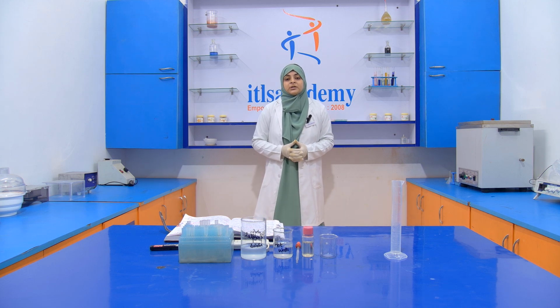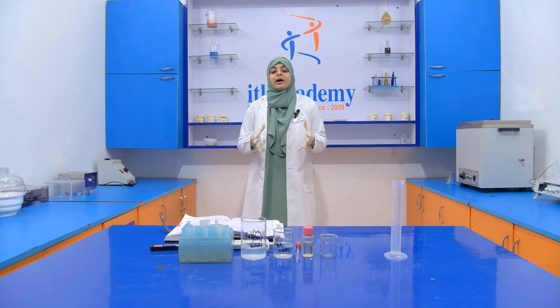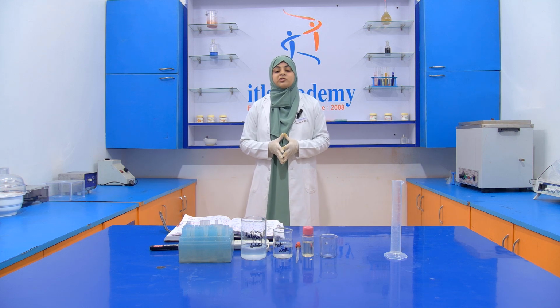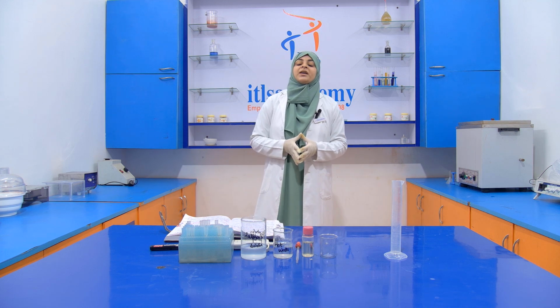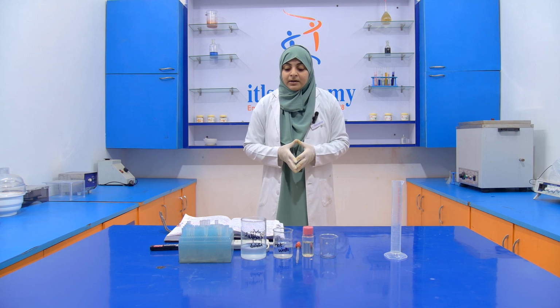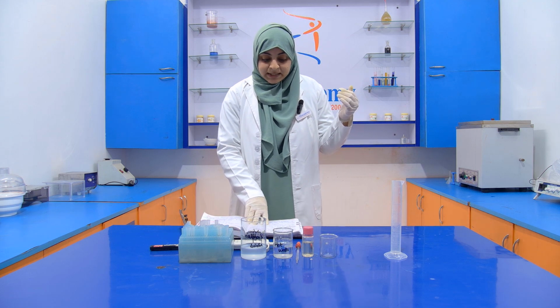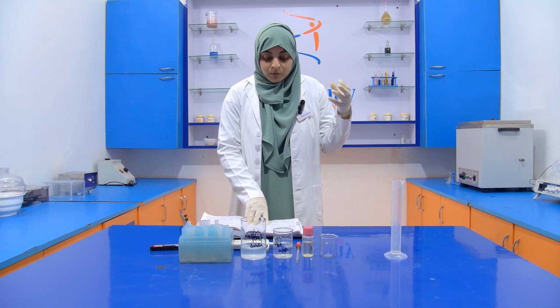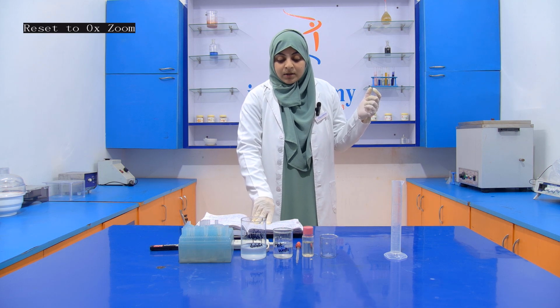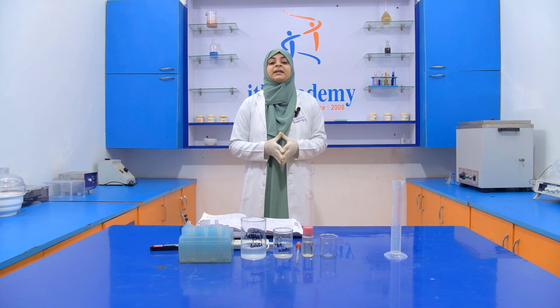But that cottonseed oil contains trans fat, and this trans fat is not good for the health of human beings. It is the reason for cardiovascular disease. That's why we have to eliminate that cottonseed oil from the edible oil. Even cottonseed contains a gossypol compound, which is toxic in nature.